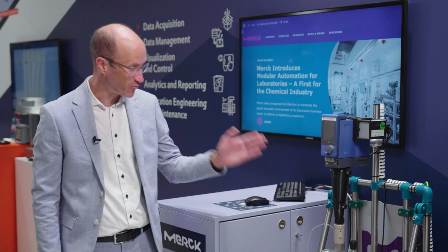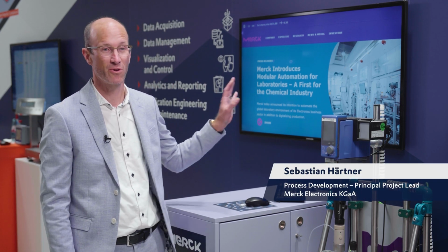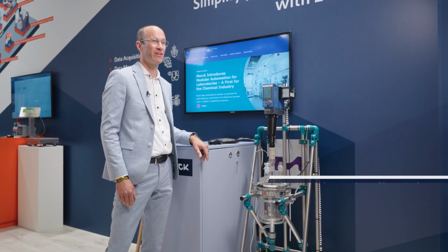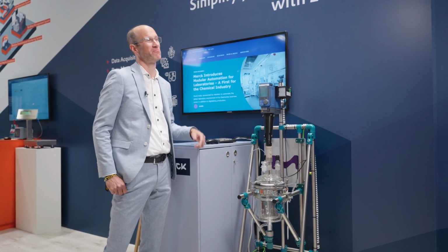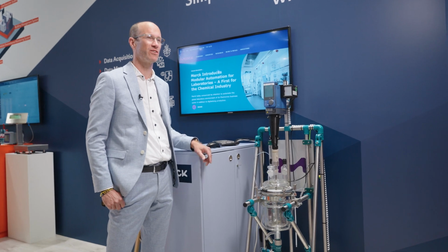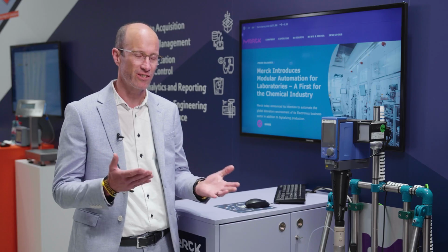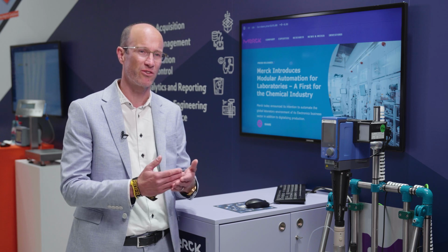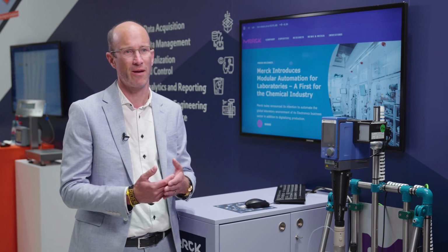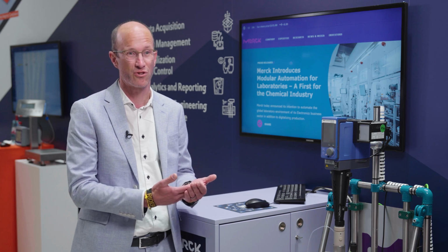This is one of our first modules, and as you can see, I think it's the perfect match for what we want to show here. With COPA-DATA, we really started to have the request, during a new building for our process development, to integrate a modular automation system. The important thing was that we wanted to fully automate and digitize our lab equipment, and at the end make data available in the future.